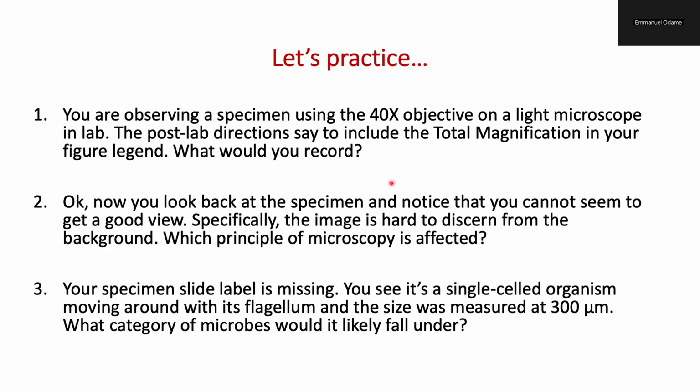Remember that we always assume that our ocular lens is 10x. So all you have to do is multiply 10 by 40, which gives you 400 times as the total magnification to record.